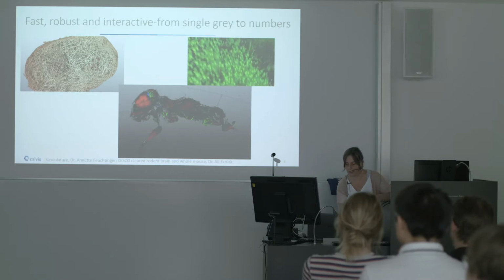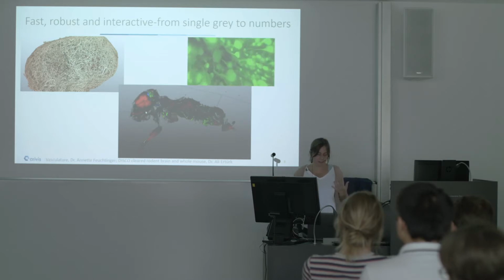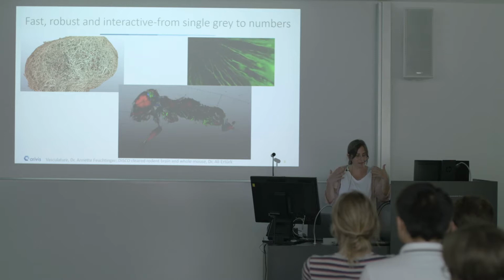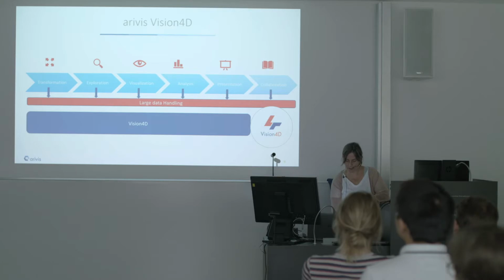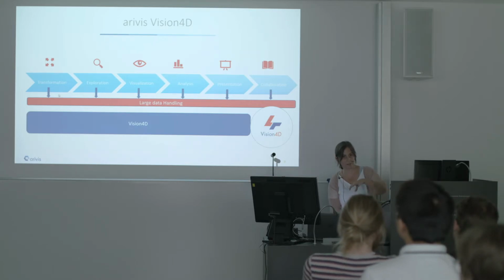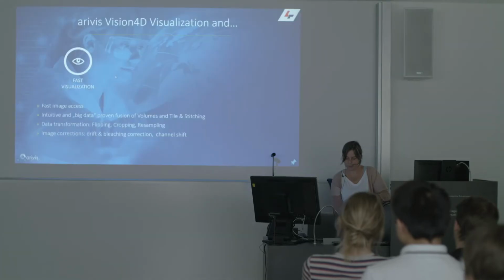And of course, like in Ali's lab, you can use the software to look at several image layers and to create screenshots as well as animated movies. But you can also alter the data, resample it, crop it, and export it to make it accessible to other software solutions, right?